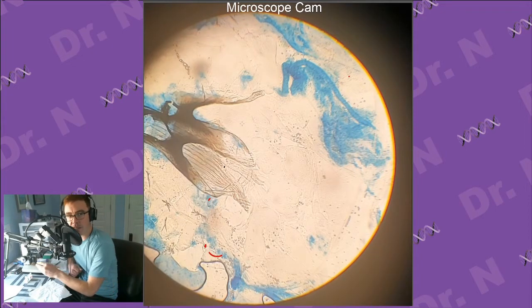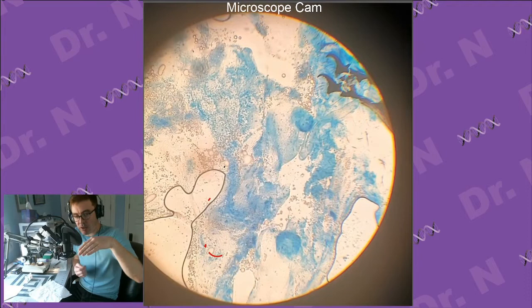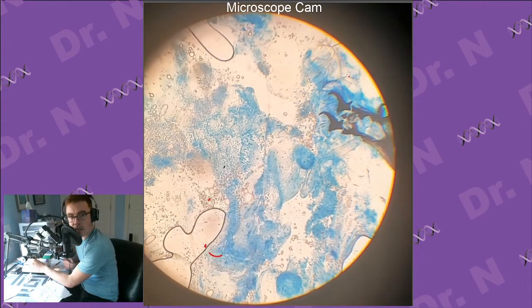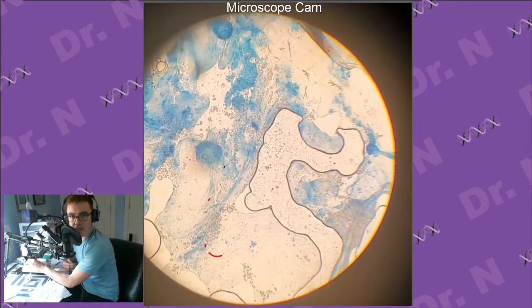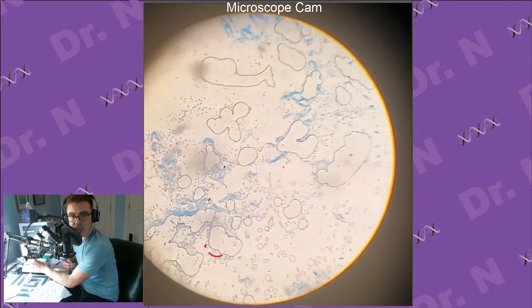I think I did a little bit of a middle ground where I wasn't able to squish hard enough, and I think I accidentally jostled it. So, up and down pressure, that's fine. That's squishing. But I think I accidentally moved my thumb a little, and that's shearing force. And that's going to rip apart everything. That is bad. That's what you don't want to do. And I think I kind of did it by accident. I do think some of these bigger cells that we were seeing up close to the mouth hooks, where there's more space, were the salivary gland cells, but they just didn't pop open the way I needed them to. And out here in the middle of nowhere, I think it's just destroyed tissue.